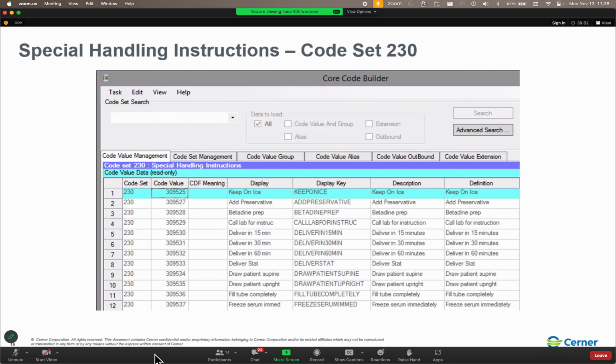I'm going to pull this up and put my note on the screen. So folks, why would I need to manually refresh a code set? Because we do not cycle server 49 in production, because that can actually break some of the other applications.